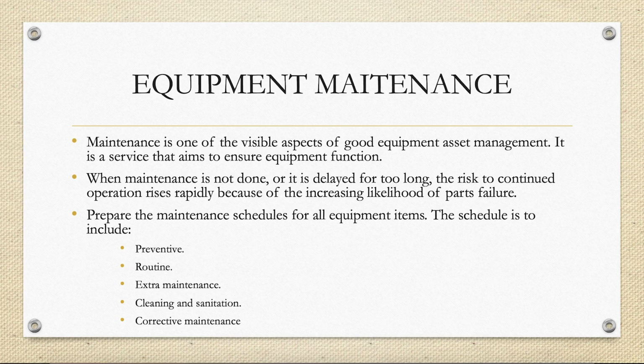Prepare the maintenance schedules for all equipment items. The schedule is to include 1. Preventive, 2. Routine, 3. Extra maintenance, 4. Cleaning and sanitation, 5. Corrective maintenance.